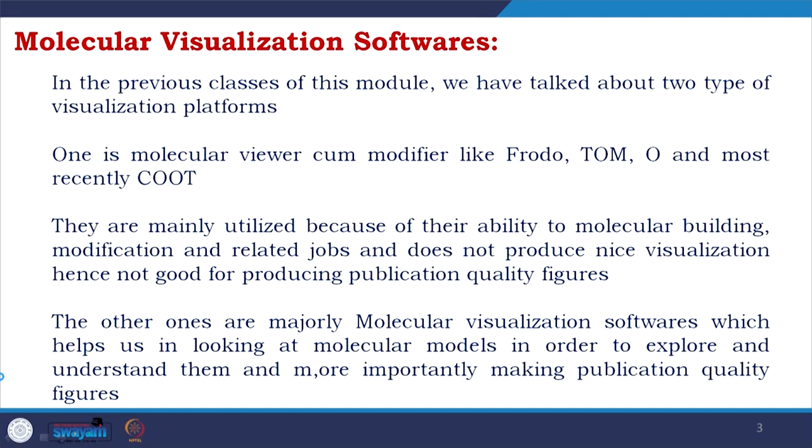These softwares are mainly utilized because of their ability for molecular building, modification and related jobs, and do not produce nice visualization, hence are not good for producing publication quality figures. So, yes, they are visualization platforms, but they are much more.